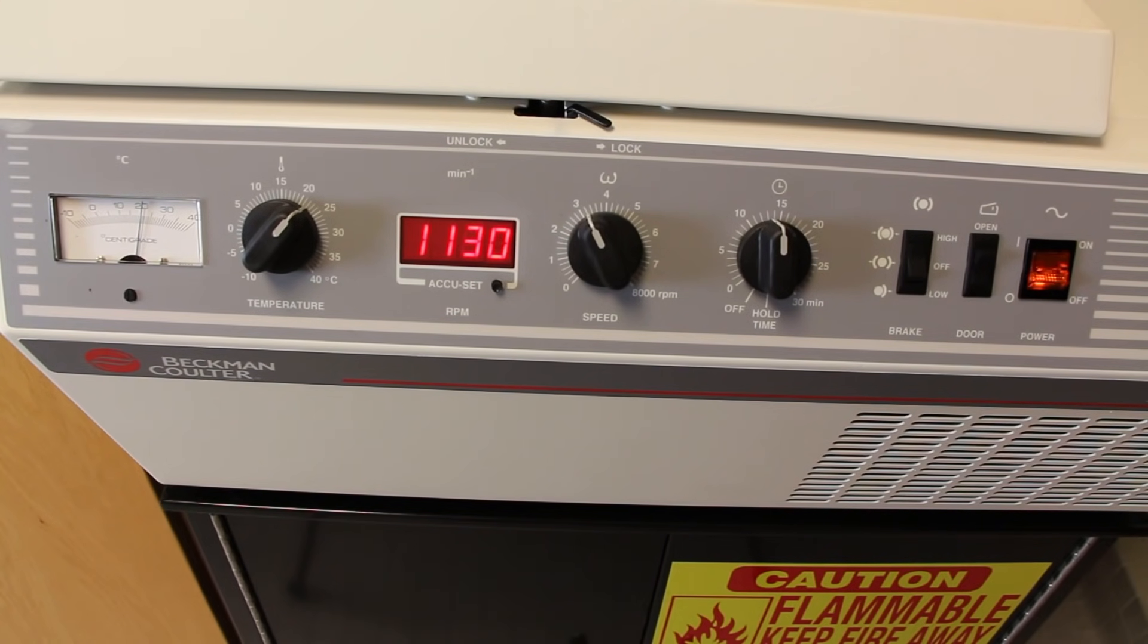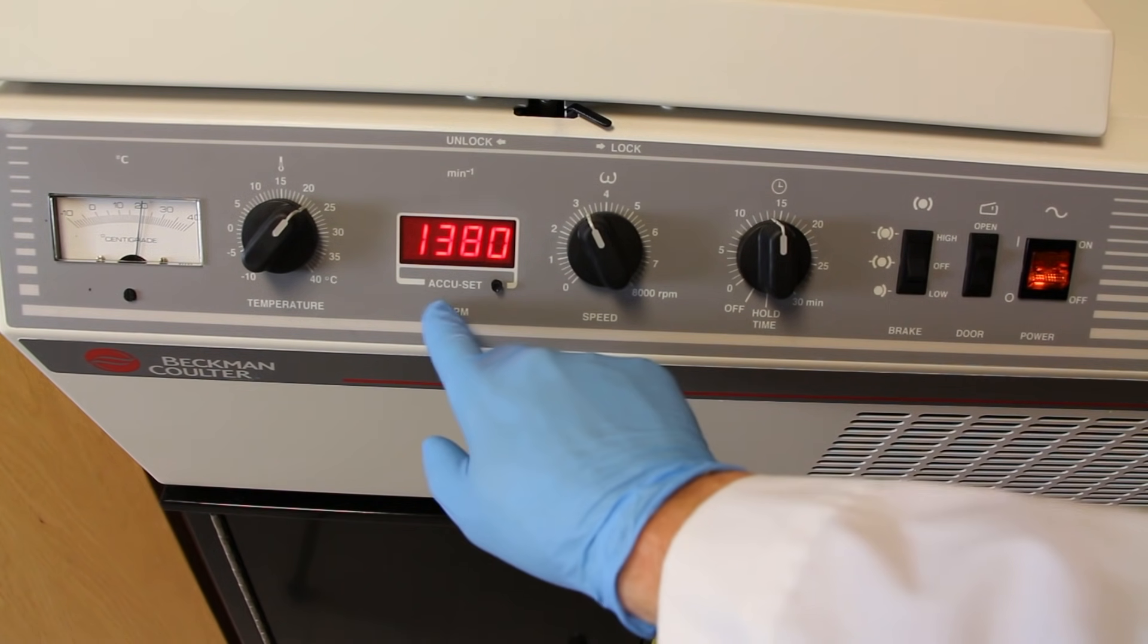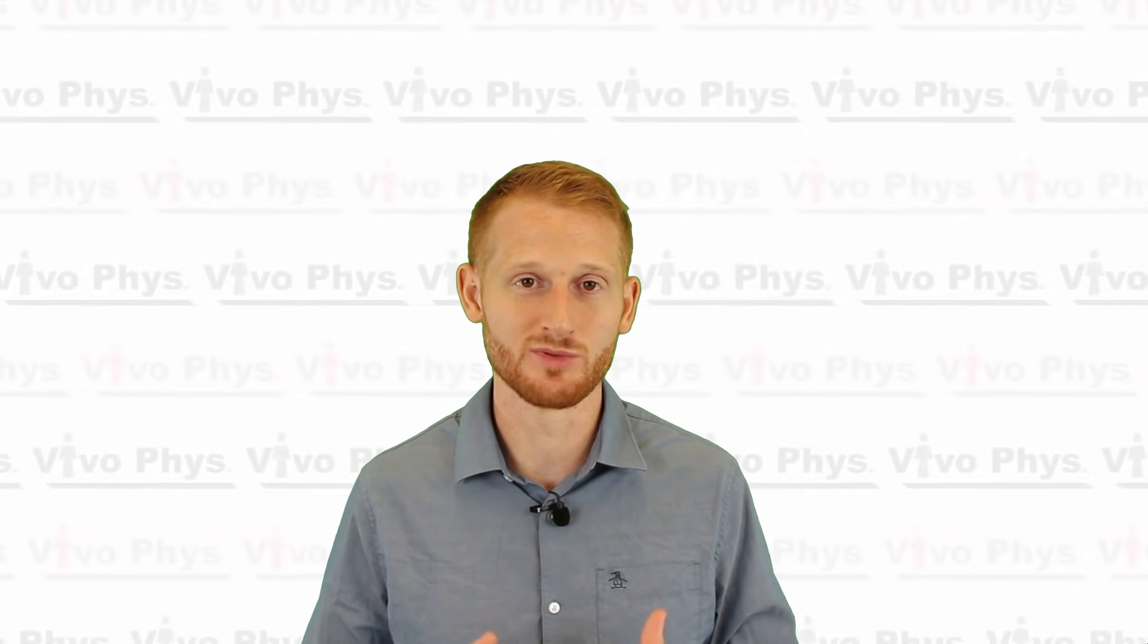You're going to see a very slow increase in the RPMs of the device because it doesn't want to start super quickly. It's going to sort of ramp up and that's going to prevent too much jostling of the blood inside the tubes, which is something you don't want. You don't want the tubes being jostled around because it's going to increase the likelihood of damaging the sample.